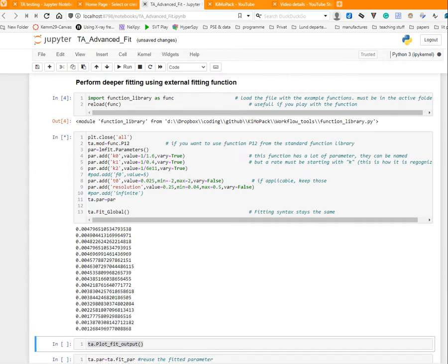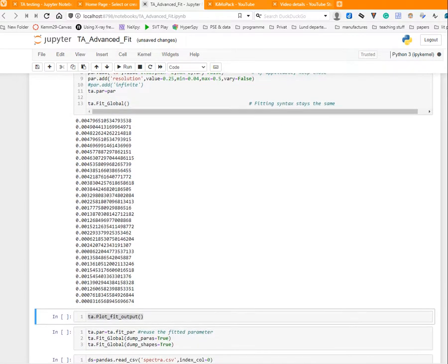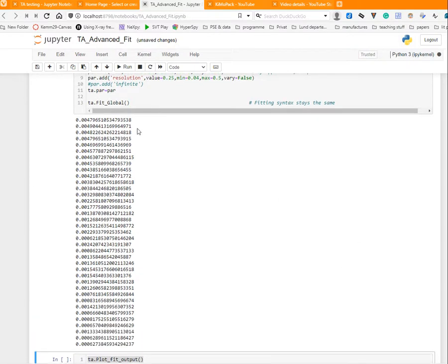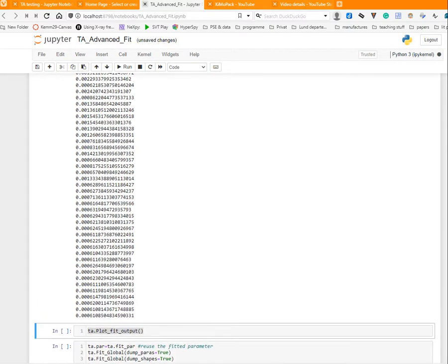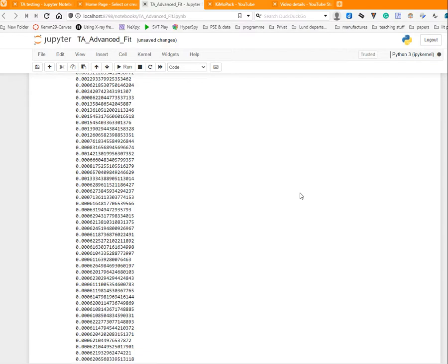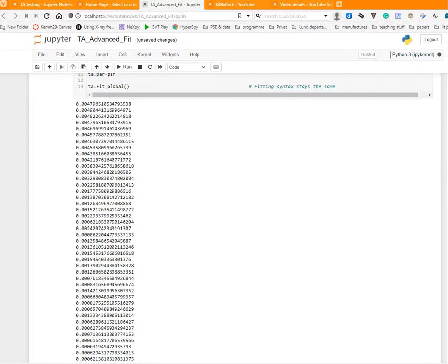It prints out the error, and it is relatively fast. Typically you need 50 to 100 optimization points before you reach that. So that's like 1-2 minutes, which means that confidence interval calculation can take 1 to 2 hours, but it gives you a very nice confidence. If you use parallel model, confidence intervals typically takes a few seconds.